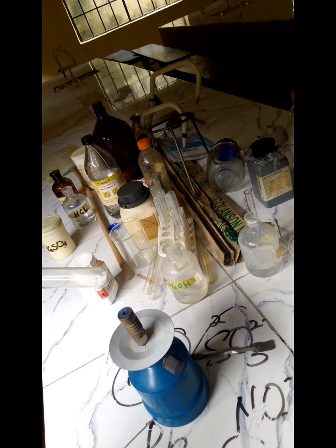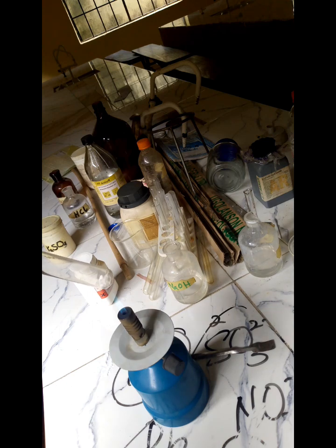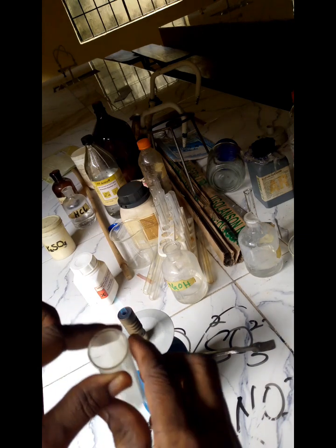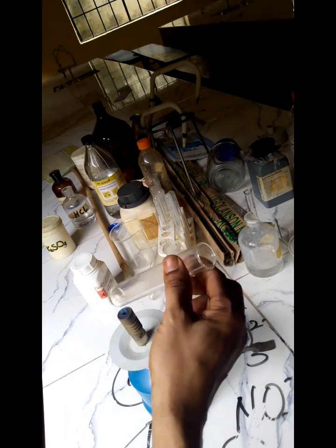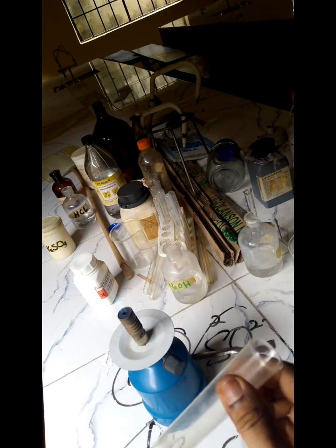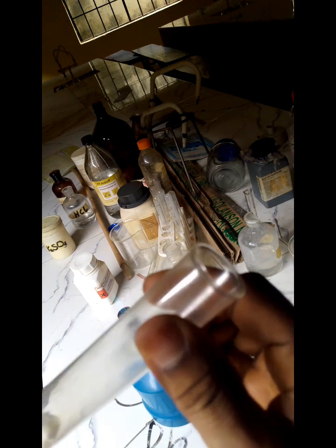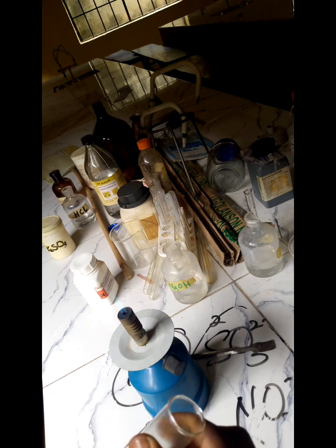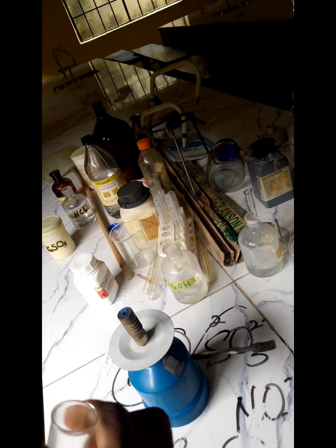It's being heated. You can hear some sound and see some gases evolving. That is a decrepitating sound. You can hear it, and you can see gas evolving.